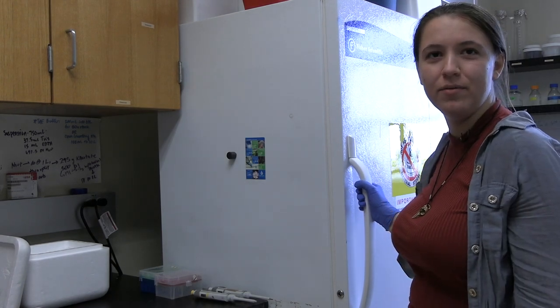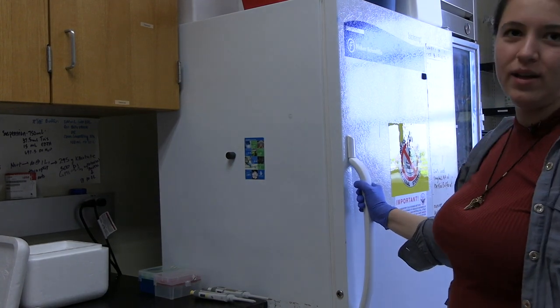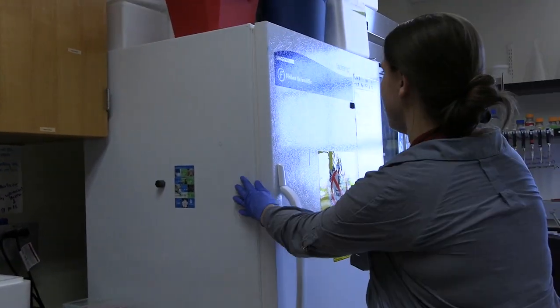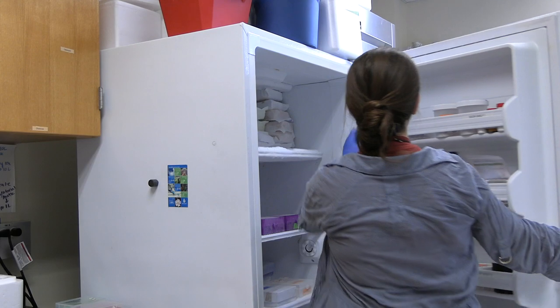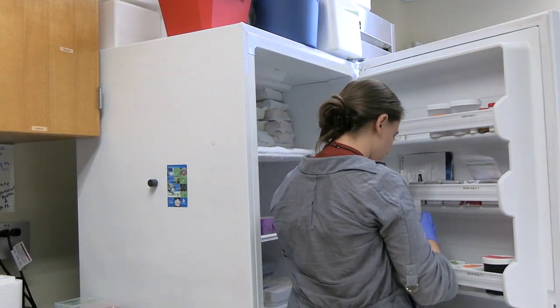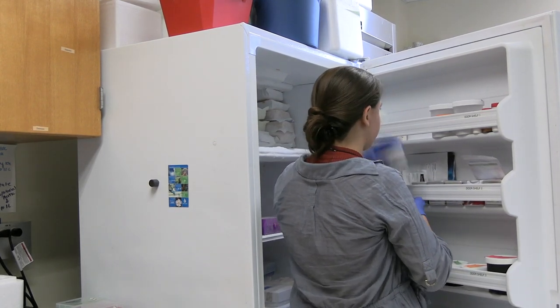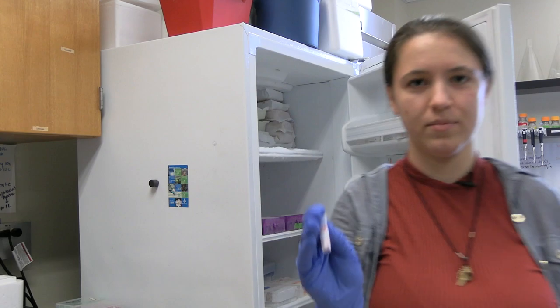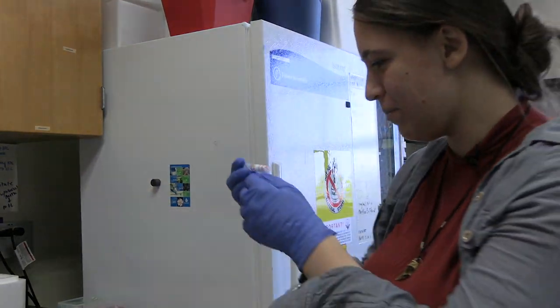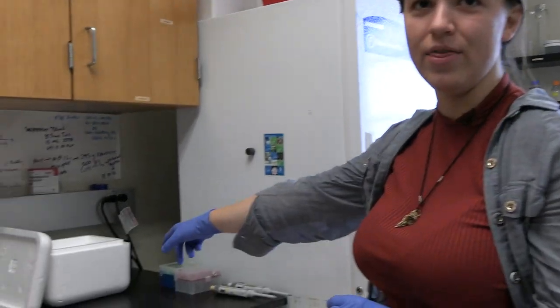I'm going to aliquot some 488 labeled phalloidin. It's kept in lyophilized powder form when they ship it. Right. So right here in minus 20C, you will see our stock. I don't know if you can see that, but there's some lyophilized powder at the bottom. We're going to dissolve that in DMSO and aliquot it on ice and throw it in the minus 20.